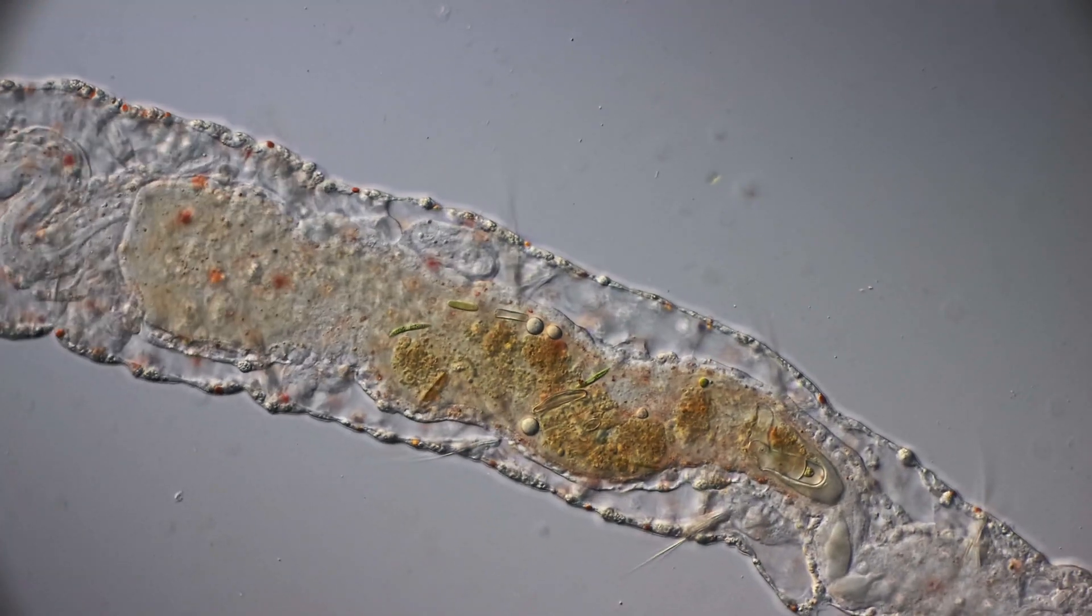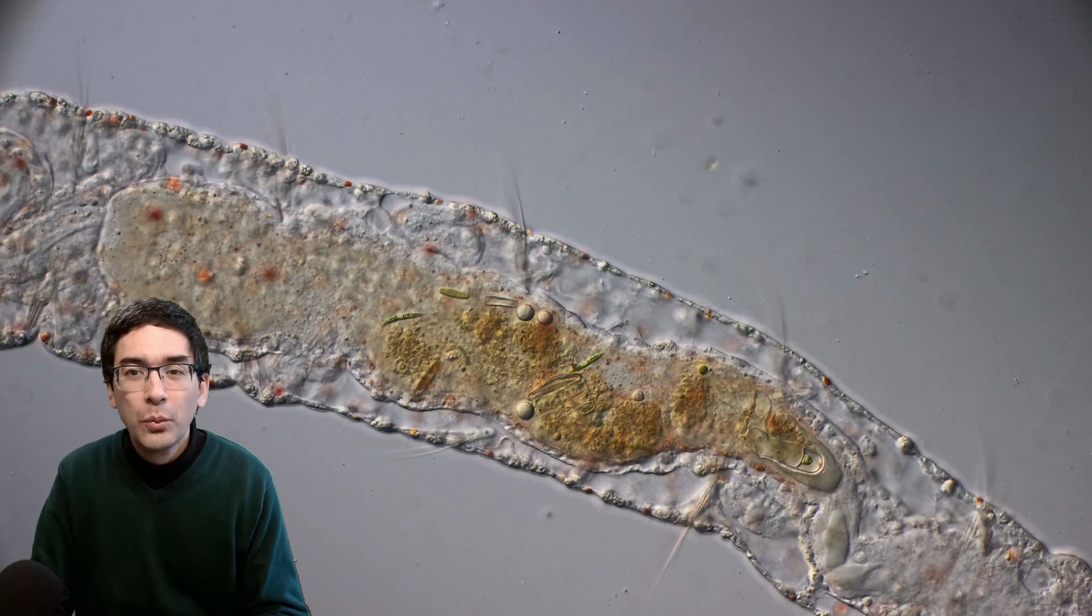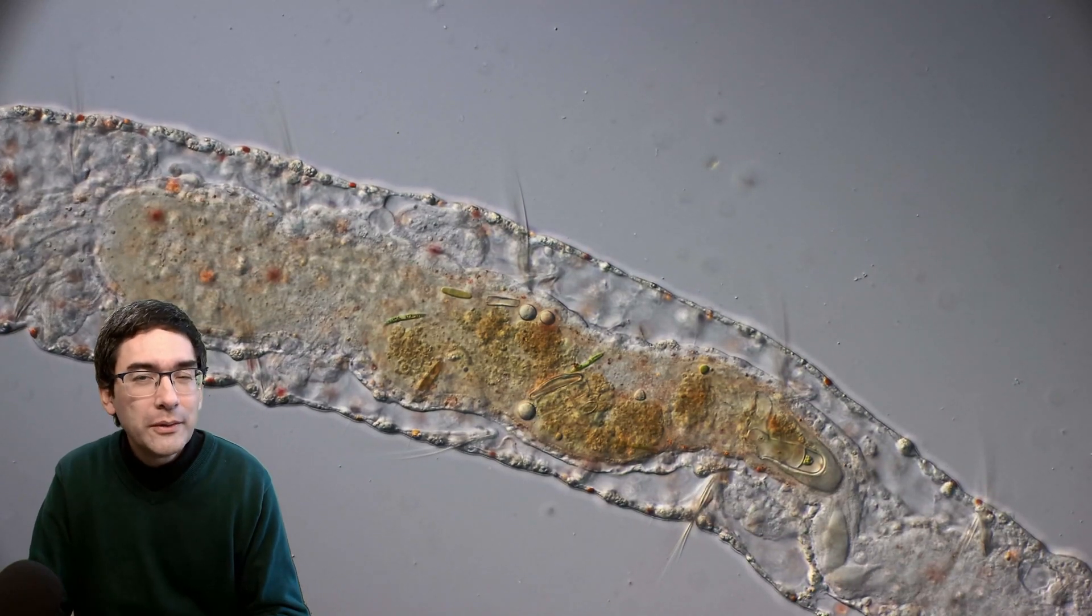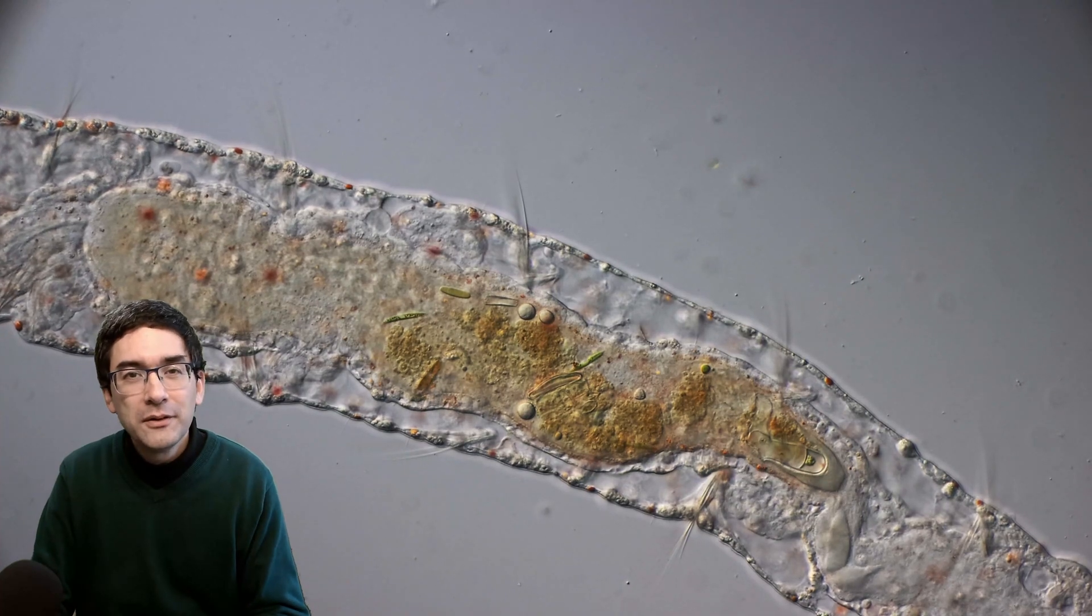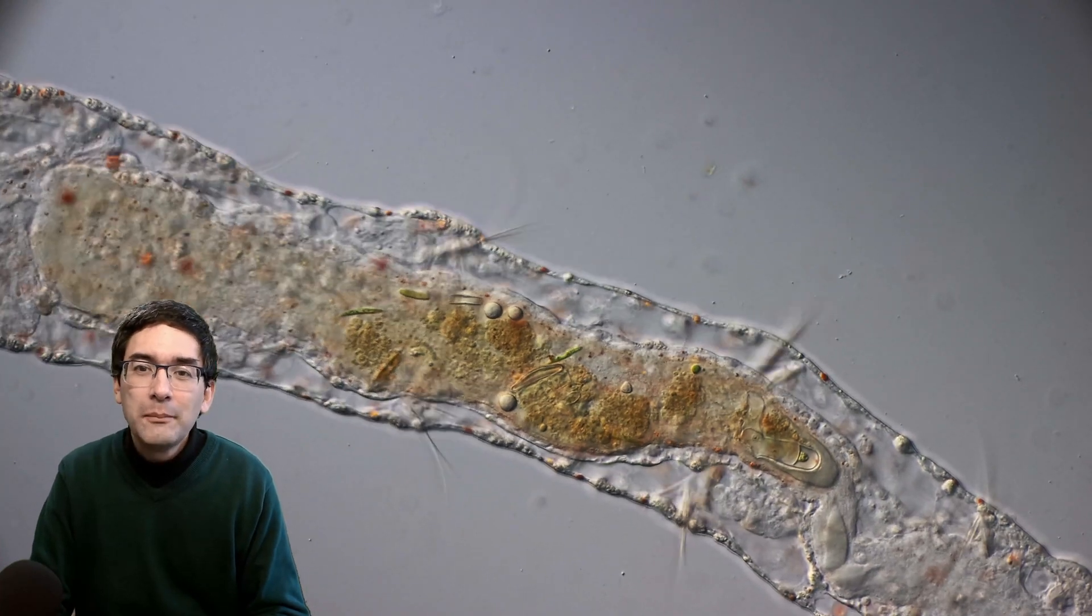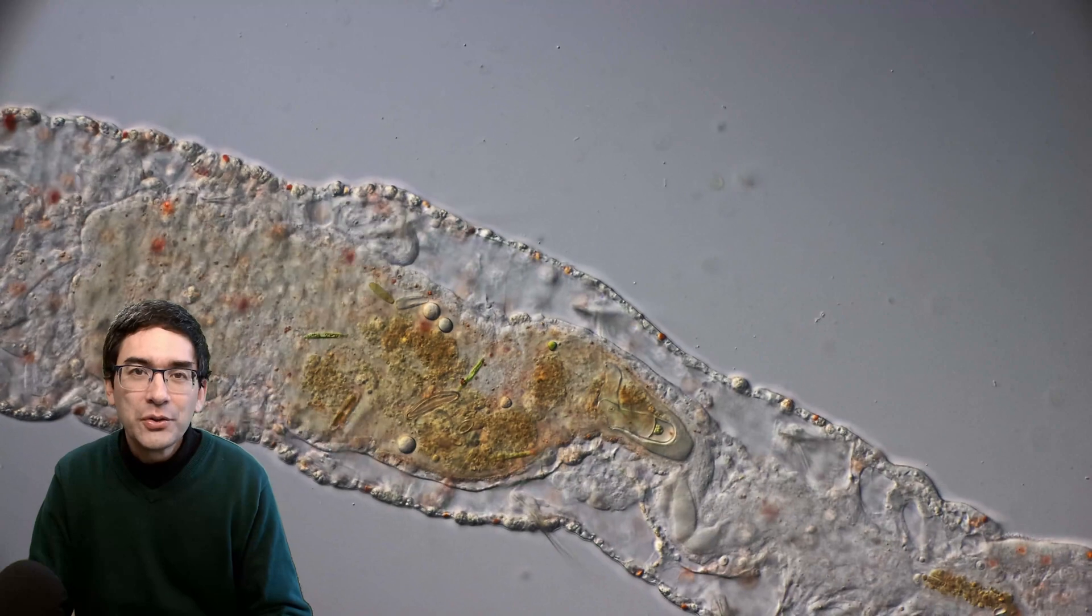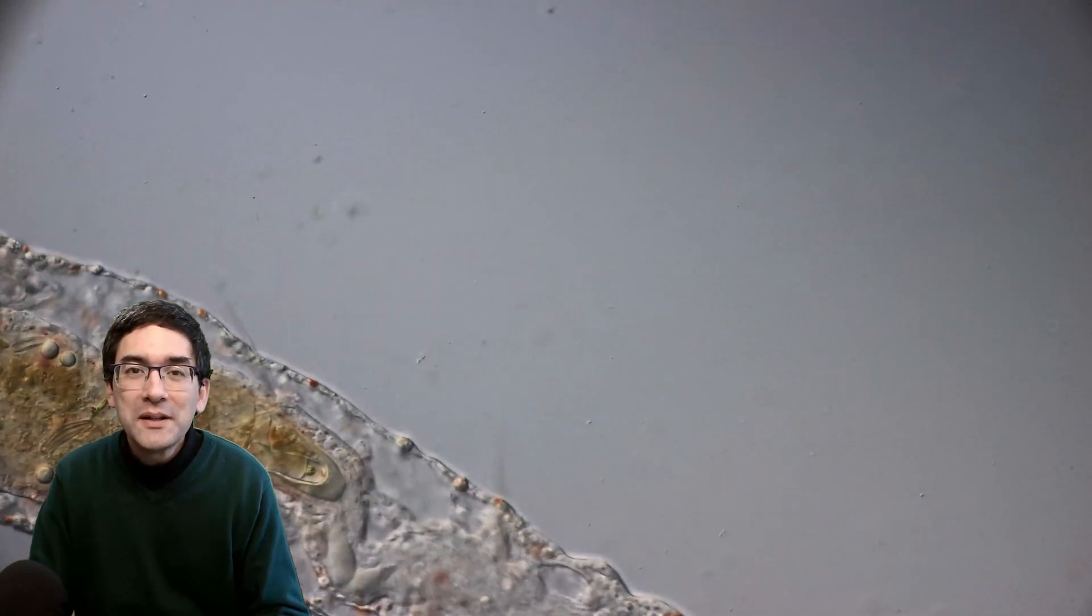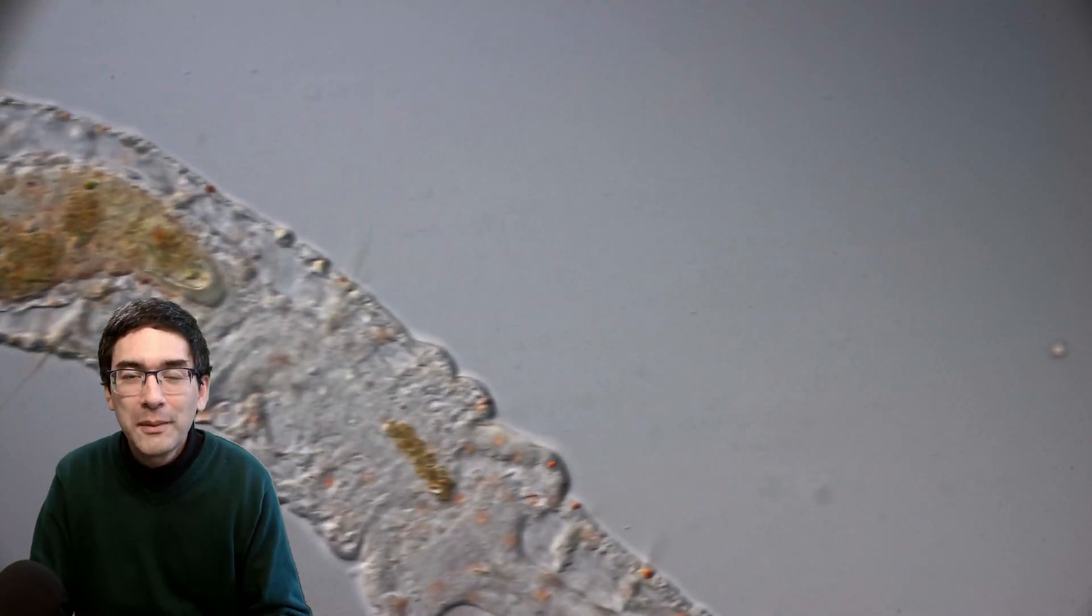Iolosoma is a fairly large microscopic worm. It can be up to a millimeter in length, and some of them even two millimeters long. Its large size and the fact that it's transparent make it quite easy to observe under the microscope.